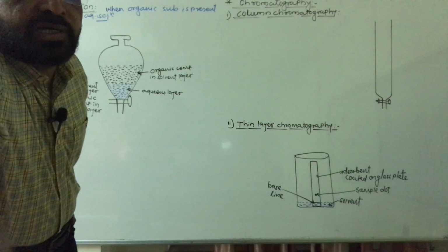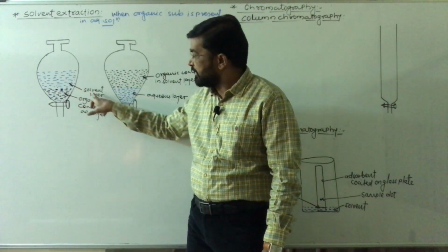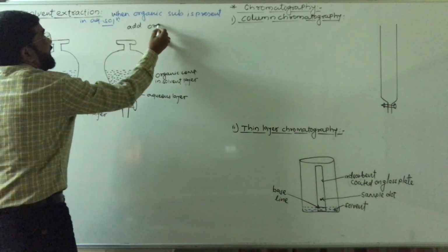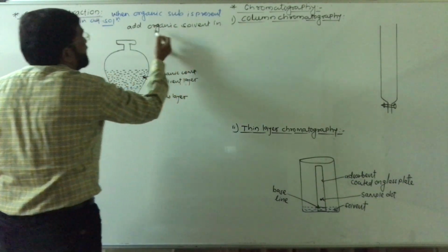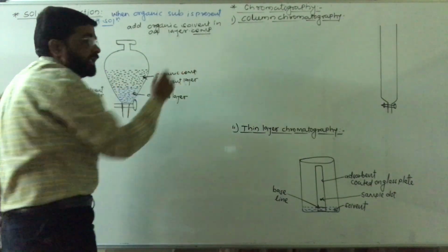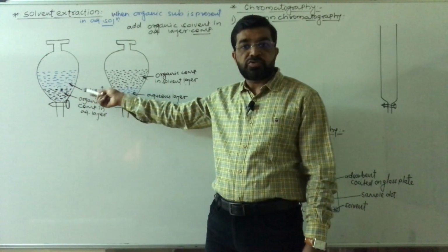Then to that aqueous layer containing the organic compound you have to add a suitable organic solvent, in which that substance is more soluble.